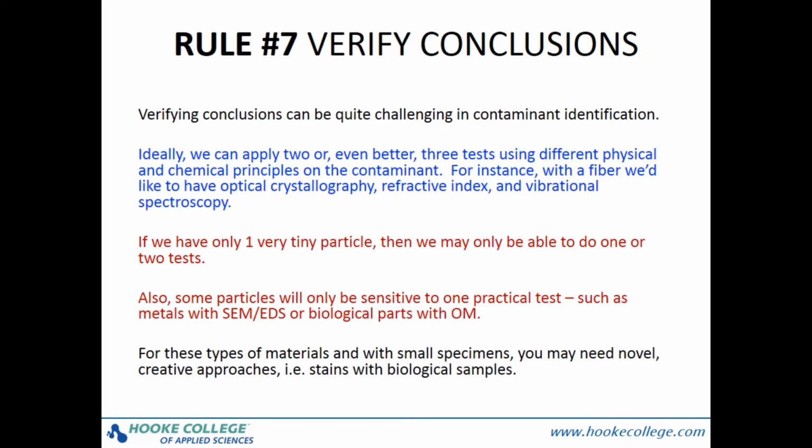If the project warrants it, you may have to spend some time with the literature looking for confirmatory tests for this type of thing or some other example such as some metals.